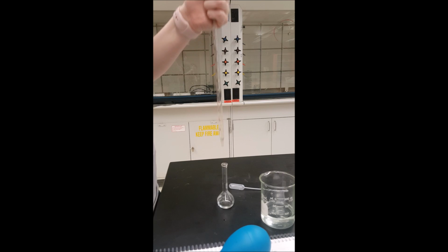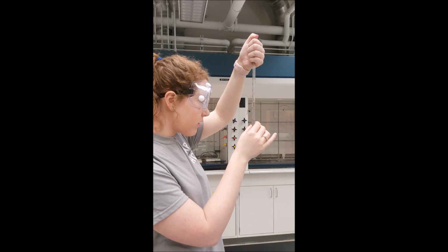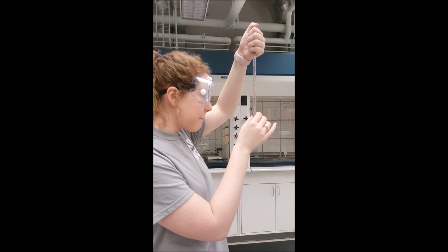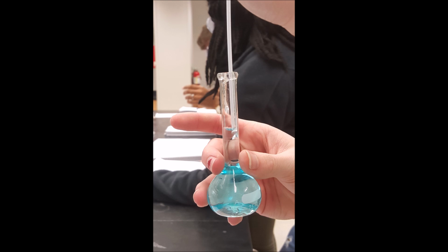Once you've done that, you can dilute your stock solution. We diluted this one with water. So you'll fill up the volumetric flask to the 25 milliliter mark with water and make sure that it is exactly 25 milliliters. If it's not, you can use a transfer pipette to get exactly 25 milliliters inside of your volumetric flask and discard the transfer pipette at the end of lab.